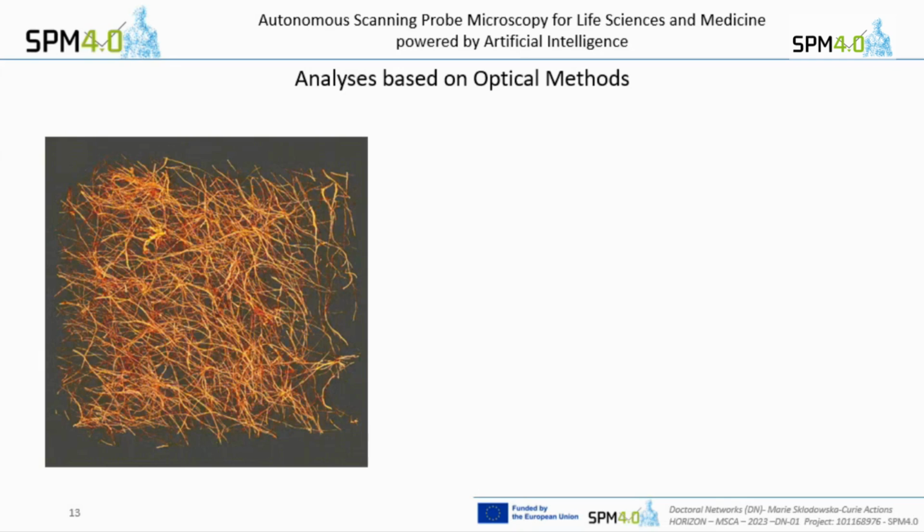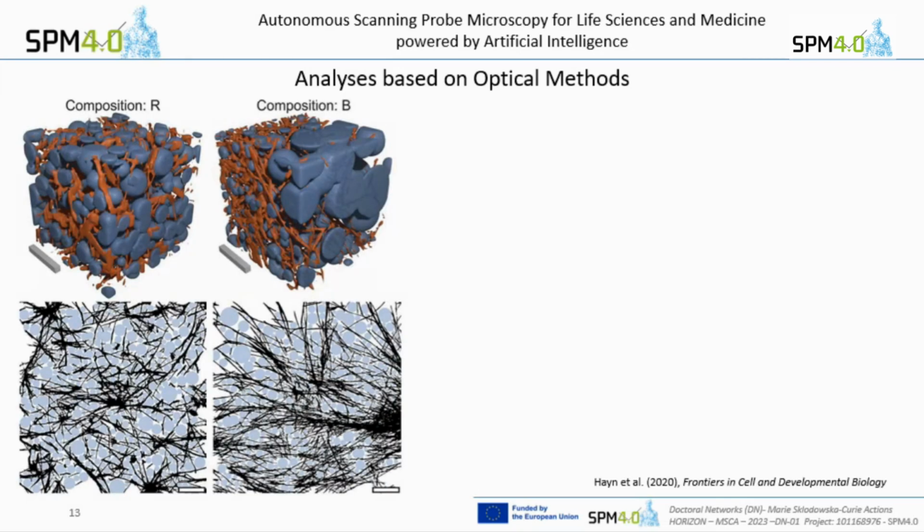That's what my colleagues did in this paper. They had a bubble size algorithm that basically puts bubbles into the open spaces. Then the bubbles grow until they hit collagen fibers, and then they shift the origin a little bit to let it grow even more. After certain iterations, they always hit collagen fibers, and this is basically your bubble size or pore size.